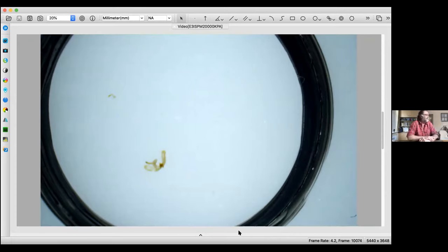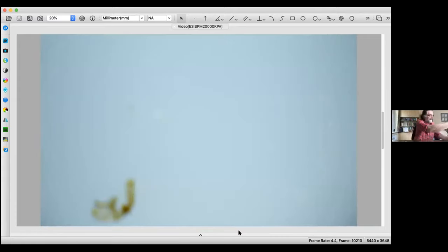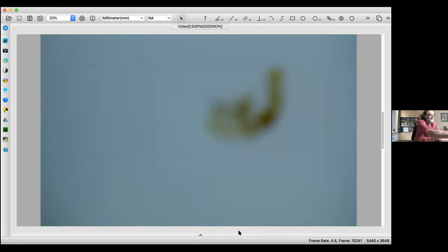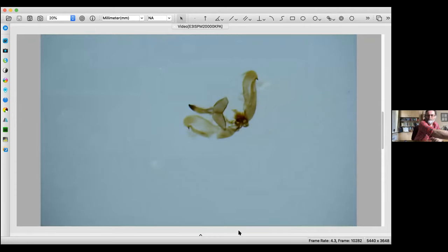What we've done is snipped off the abdomen and popped it in a test tube. When it goes into the test tube, we pop out another little label — we do two labels: one stays with the specimen and one goes in the test tube. So you're getting the idea — there's an awful lot of labelling that goes on. And then eventually we turn it into a slide.